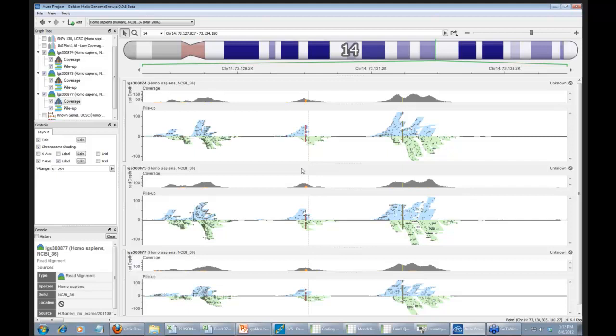The problem with this technology is that you're always going to have this outlier sequence that is problematic. If you increase the coverage and you can cut that away, I think you'll be much more confident in the calls. It's really, I think, too early to say, as far as what thresholds we're going to have to put on the data to say, yeah, this is real.